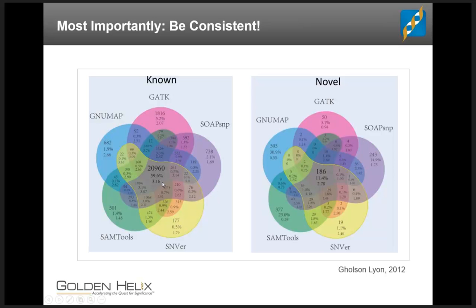But it's not just the variant callers. If you move upstream and look at everything starting from exome capture, moving on to alignment and indel realignment and all of the different phases before you even get to variant calling, we've seen a lot of situations where just swapping out one of those upstream steps will result in technical artifacts that are expressed at the variant caller stage. And if you're not watching out for it, it can really influence your analysis. So I can't say it firmly enough. You need to make sure that everything is done very consistently when you start looking at rare variants in sample groups.